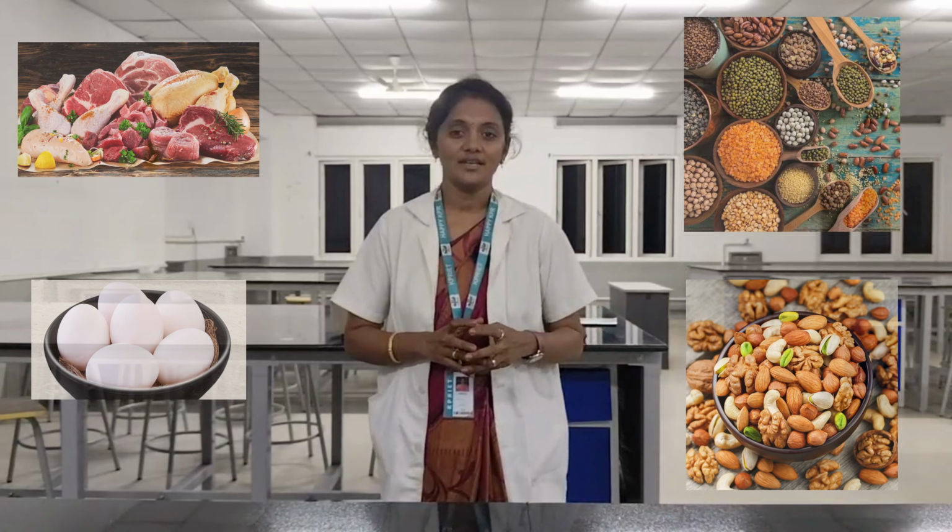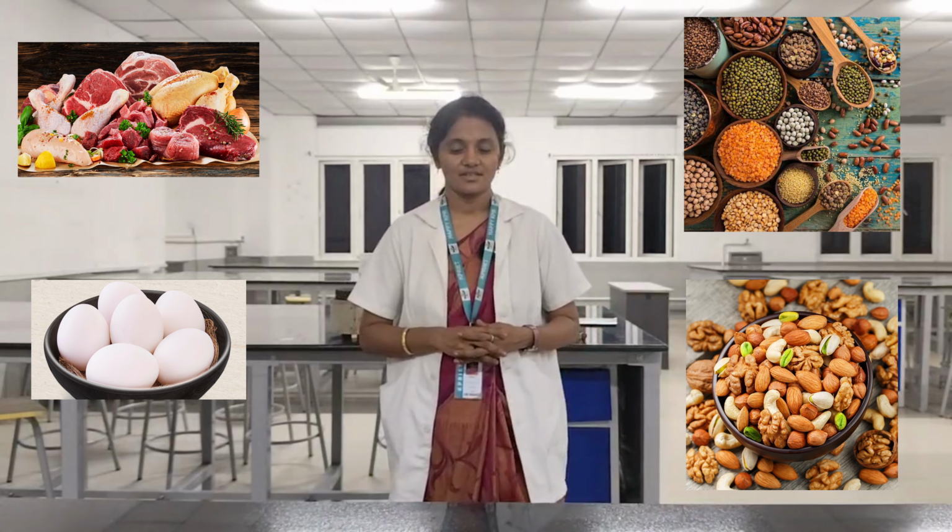Proteins are very essential for our body because they maintain the structure, regulation and functions of every cellular process in our body. Proteins are found in plenty of foods like meat, egg, pulses, nuts, etc. In today's session, we are going to see the qualitative tests of proteins.